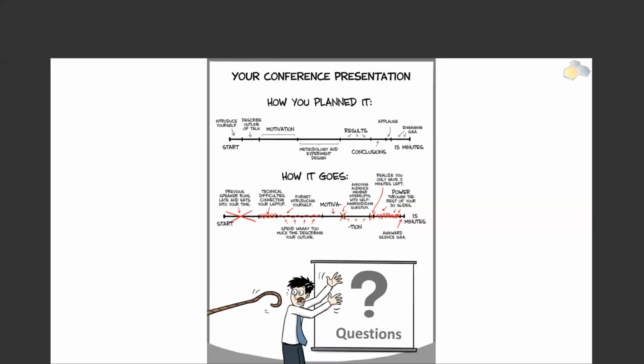But yeah, this is an ongoing challenge, and specifically for even more sophisticated tools, this is something that's hard to assess with one single publication.